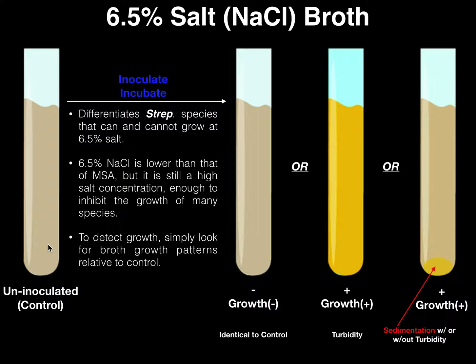We're going to start with a test tube that contains what looks like normal TSB broth. TSB is just a simple growth broth — whenever you take your stock solutions of bacteria, they're in TSB. It's going to look just like that. The only relevant difference is that this broth has an additional 6.5% salt.